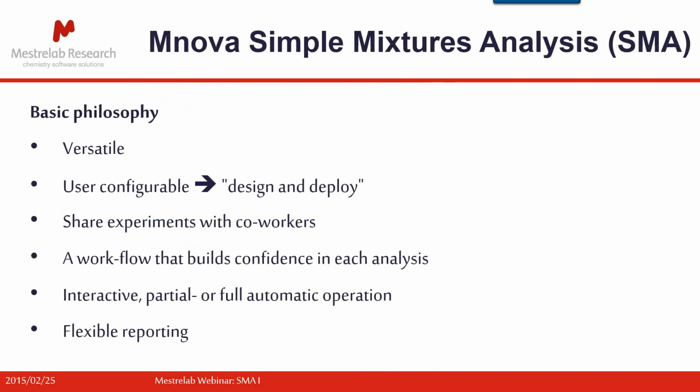Okay, so what's the basic philosophy behind the simple mixtures analysis, this SMA that we're talking about today? We've wanted to build something that's versatile, which is to say that it's not going to be restricted to one particular analysis. It's going to be applicable to hopefully almost any analysis really. And to achieve this, we've made it fully user configurable, and I call this a design and deploy approach.